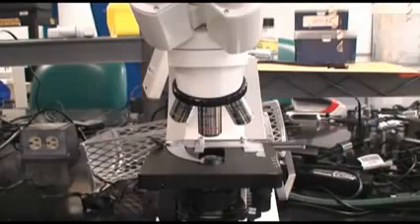Seen here are examples of gram-negative, gram-positive, and gram-positive and negative bacteria slides. Color and bacteria characteristics can be used to identify the differences between the gram-positive and gram-negative bacteria.